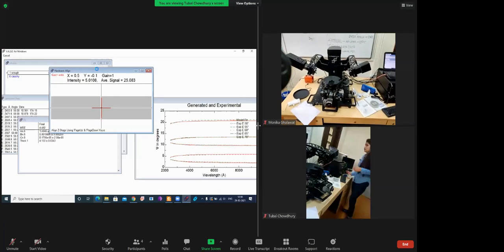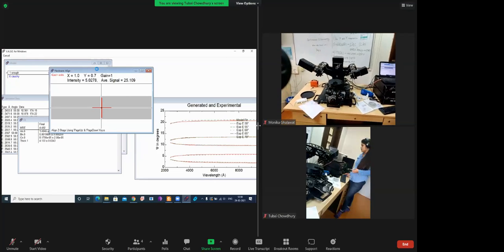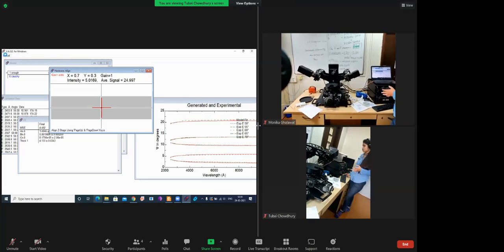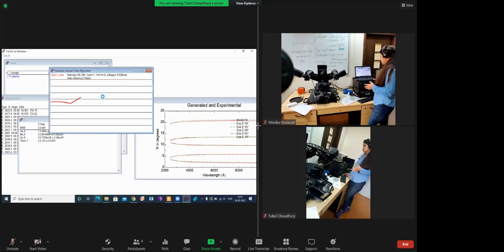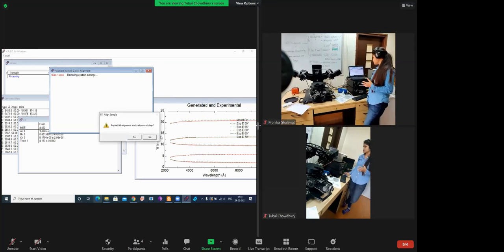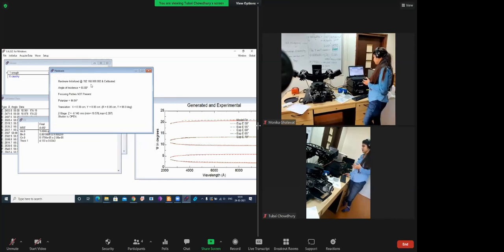It will take more time. So you have to be very precise. It's aligned, so we can go for cancel. Again, it will check whether all are visible or not. All are visible, so there is no need of doing alignment again.